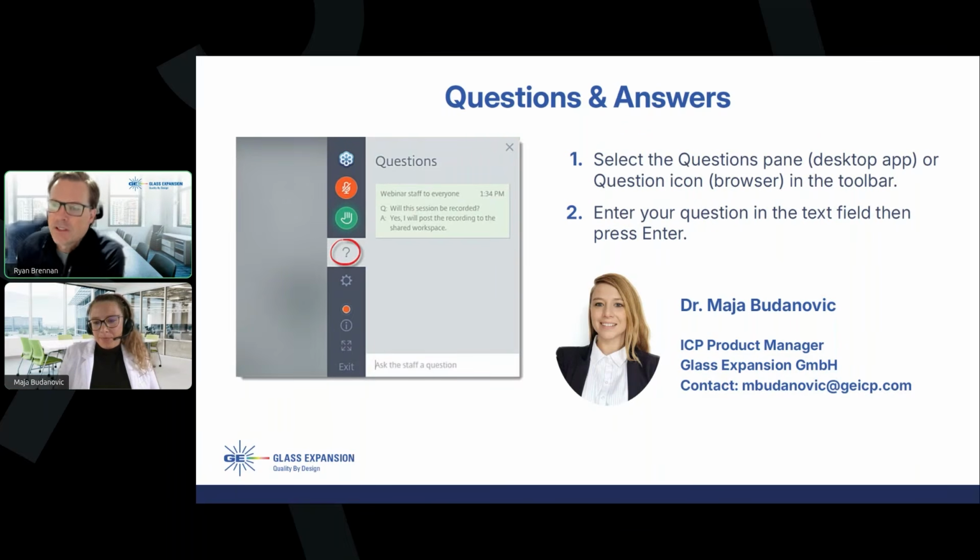Thank you, Maya. Staying on the topic of maintenance, there were two other questions that came in. If you could give some advice on what are good methods for cleaning your torch and spray chamber.